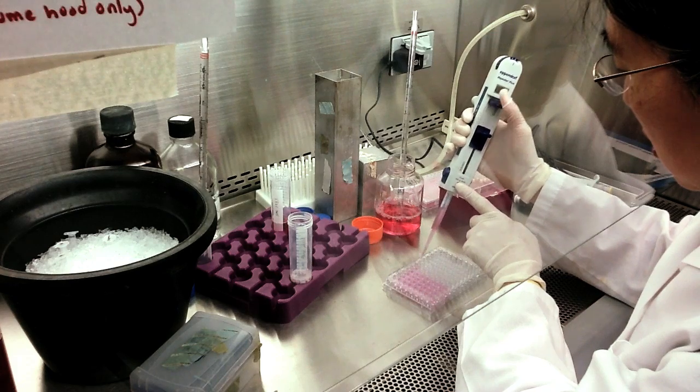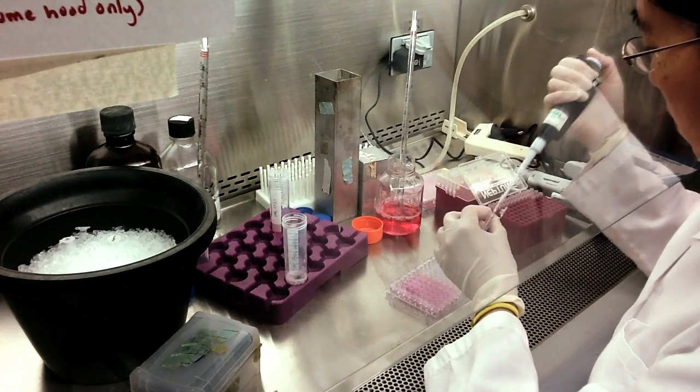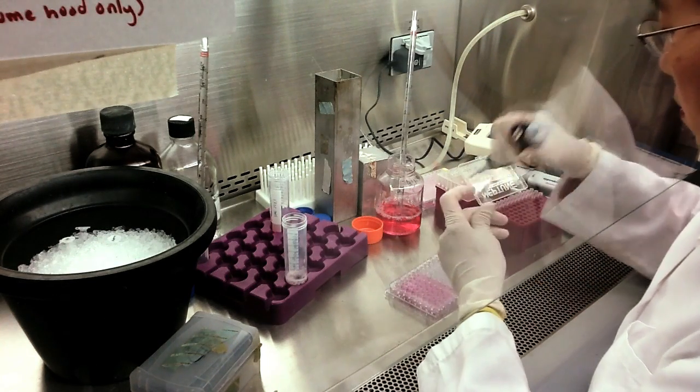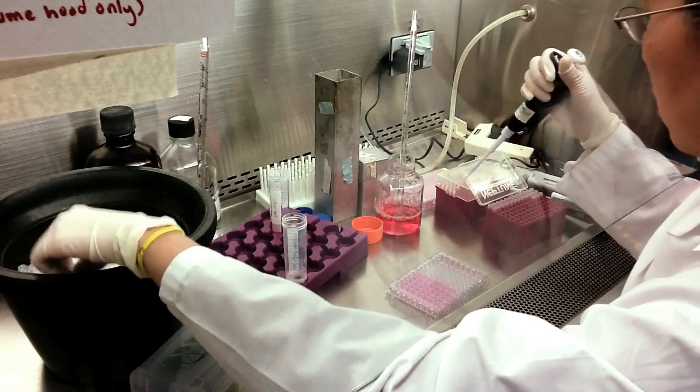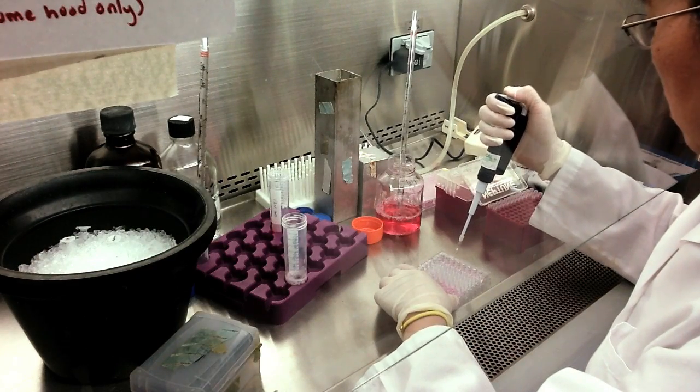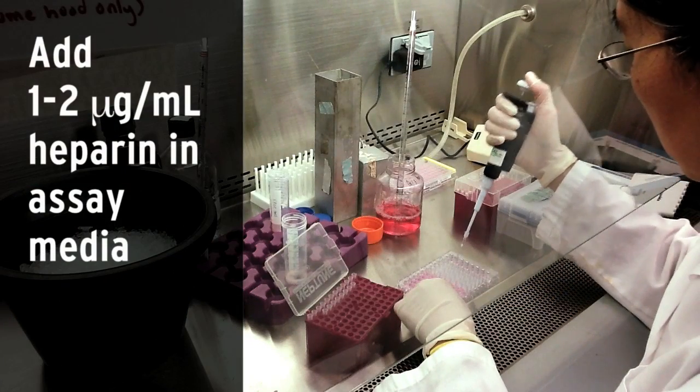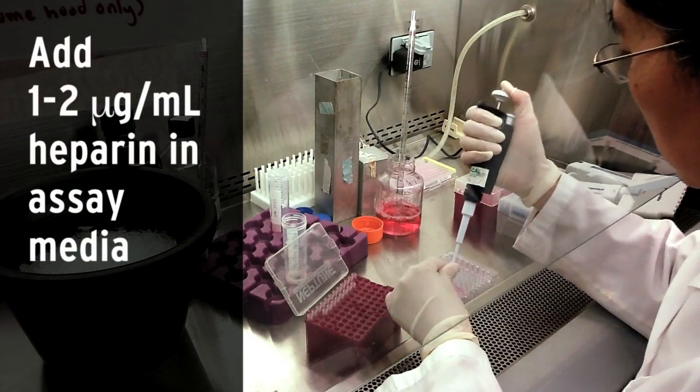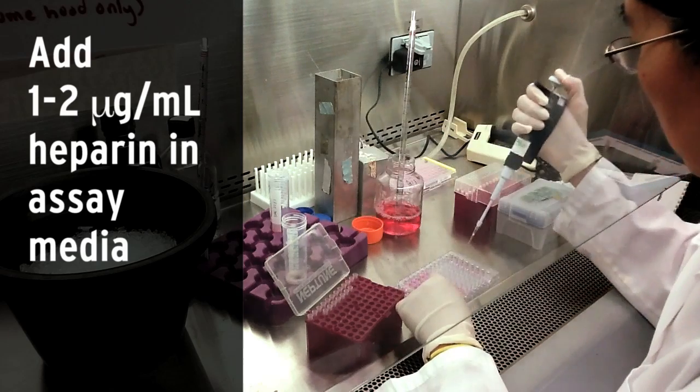A second round-bottom 96-well plate is used to make serial dilutions of FGFs to be assayed. Because BATH-3 cells lack cell surface heparin sulfate proteoglycans, it is necessary to include heparin at a concentration of 1-2 micrograms per ml in the assay media.